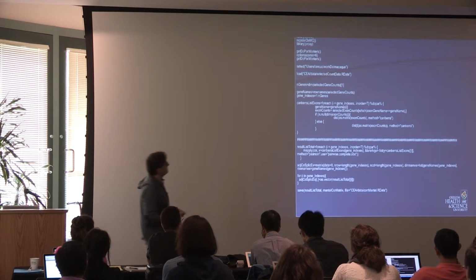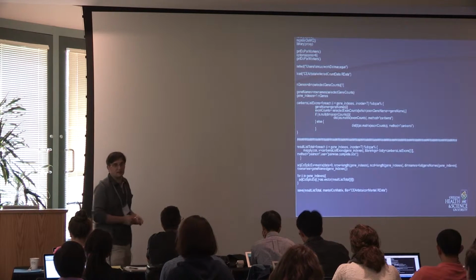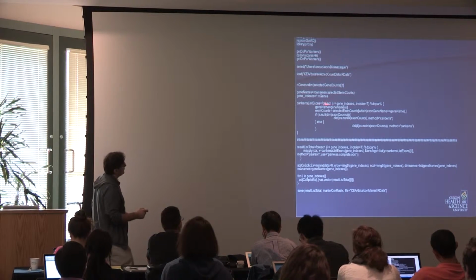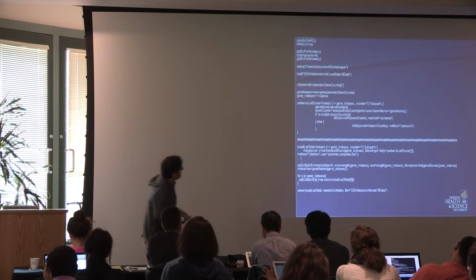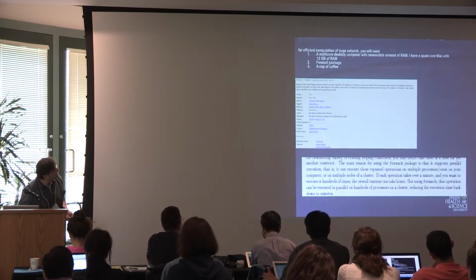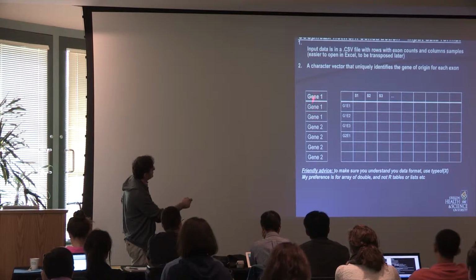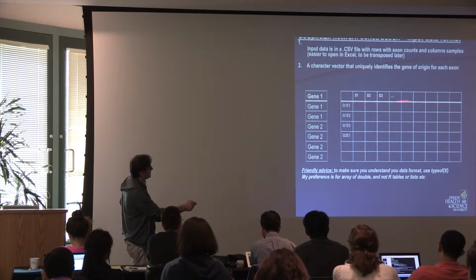So here's the code for the co-splicing network. The first step, you load your data. You make sure that it's in the format that I just described. You have your number of genes and your gene names and so on. So now we have the foreach loop. I go and select for each gene all its exons. So let's go back to the data. The first iteration of the loop, you say, what says gene 1? You see the first 3 rows are all gene 1, and those are the exons. So now you select that matrix out of your whole data set.